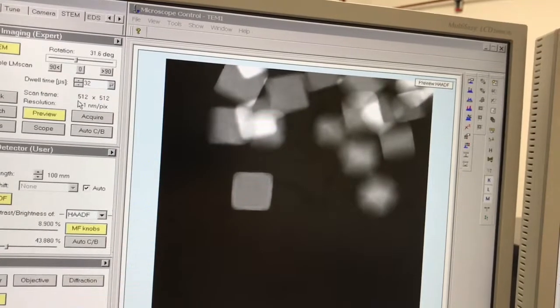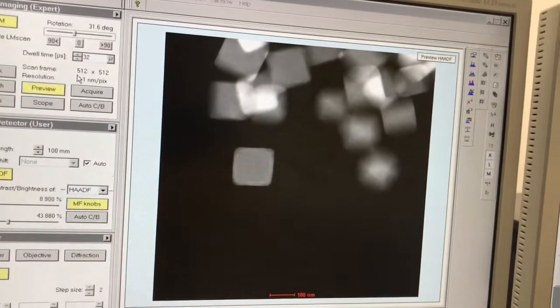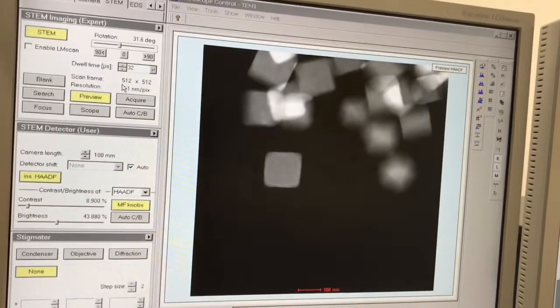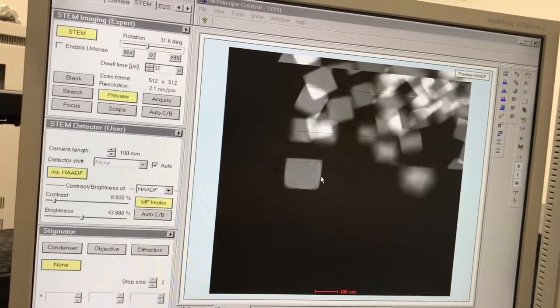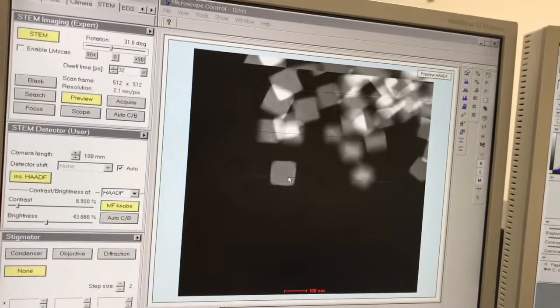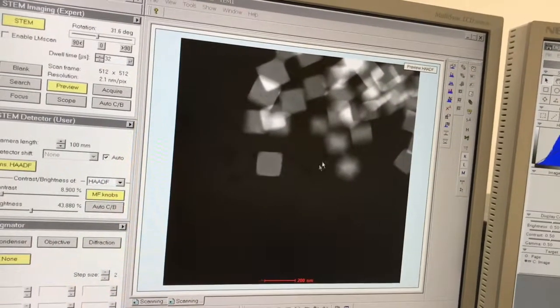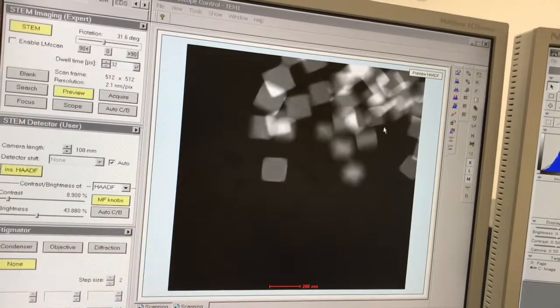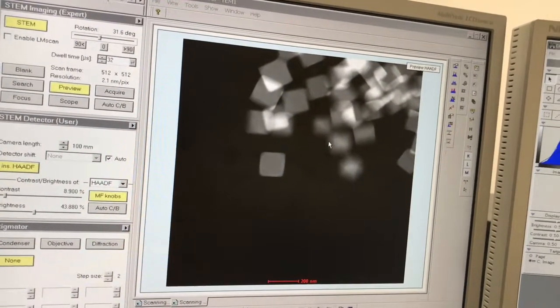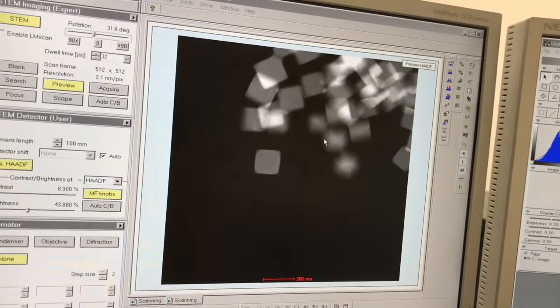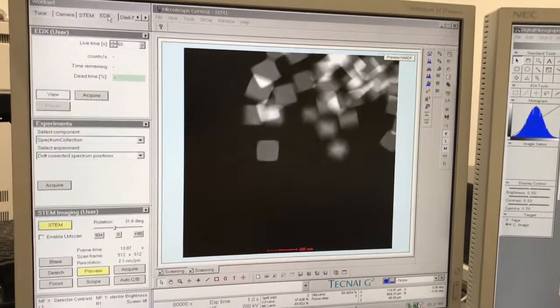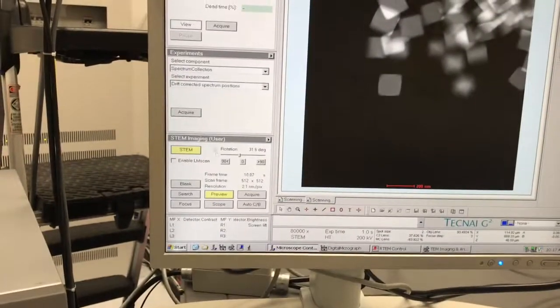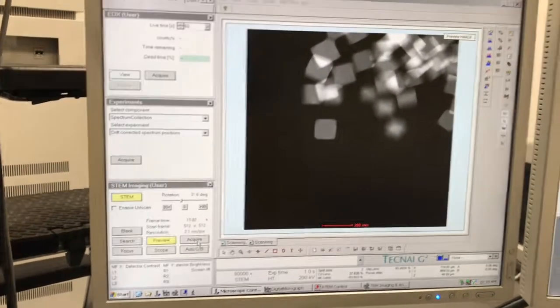The particle is aligned, and we've got the image focused and stigmated. If we want to do just a line scan across this particle, I'll decrease magnification a little bit. When doing this, because we're going to use drift correction, you need to make sure there's an area in the specimen that can be used as a reference — we've got lots of unique, easily identifiable area here. So now I go to the EDS tab, and I need to acquire a STEM image. You have to do this every time before you do any type of spectrum image.